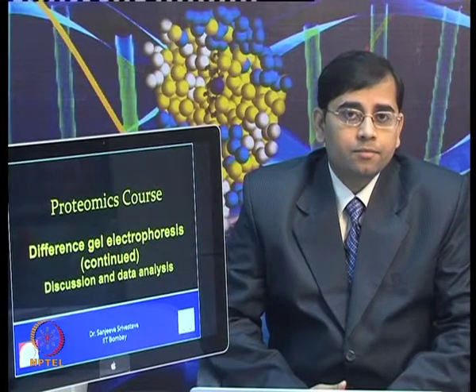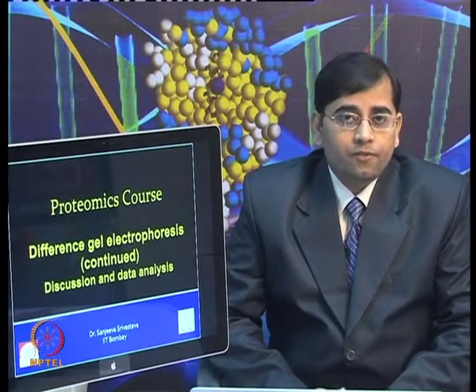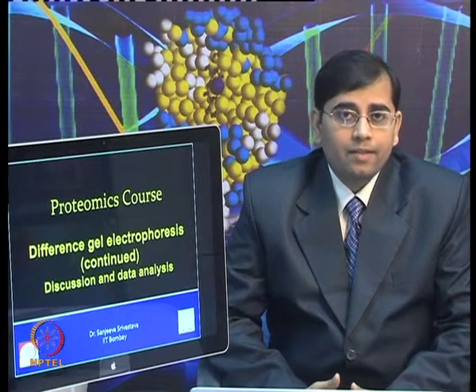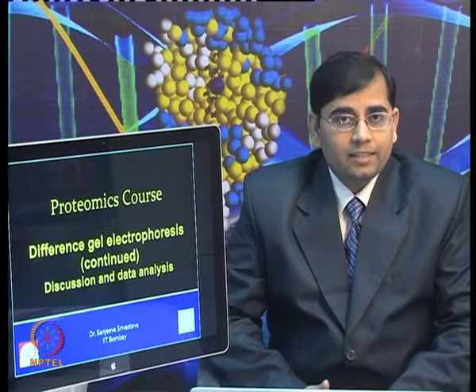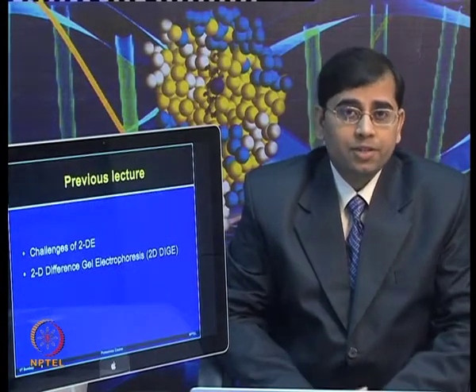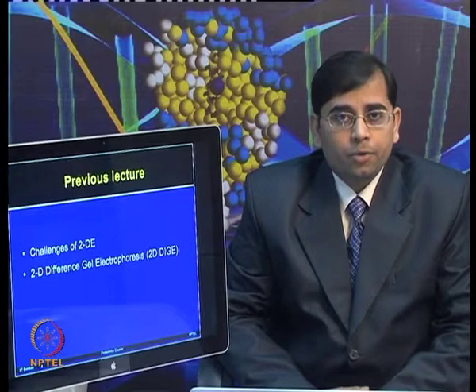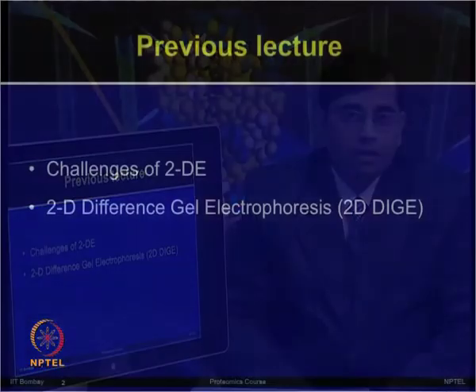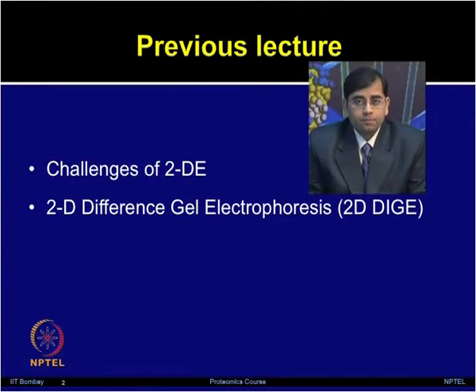In the last class, we talked about difference gel electrophoresis, or DIGE, and you have seen how to perform the DIGE experiment in detail. In the previous lecture, we discussed different challenges associated with two-dimensional electrophoresis.